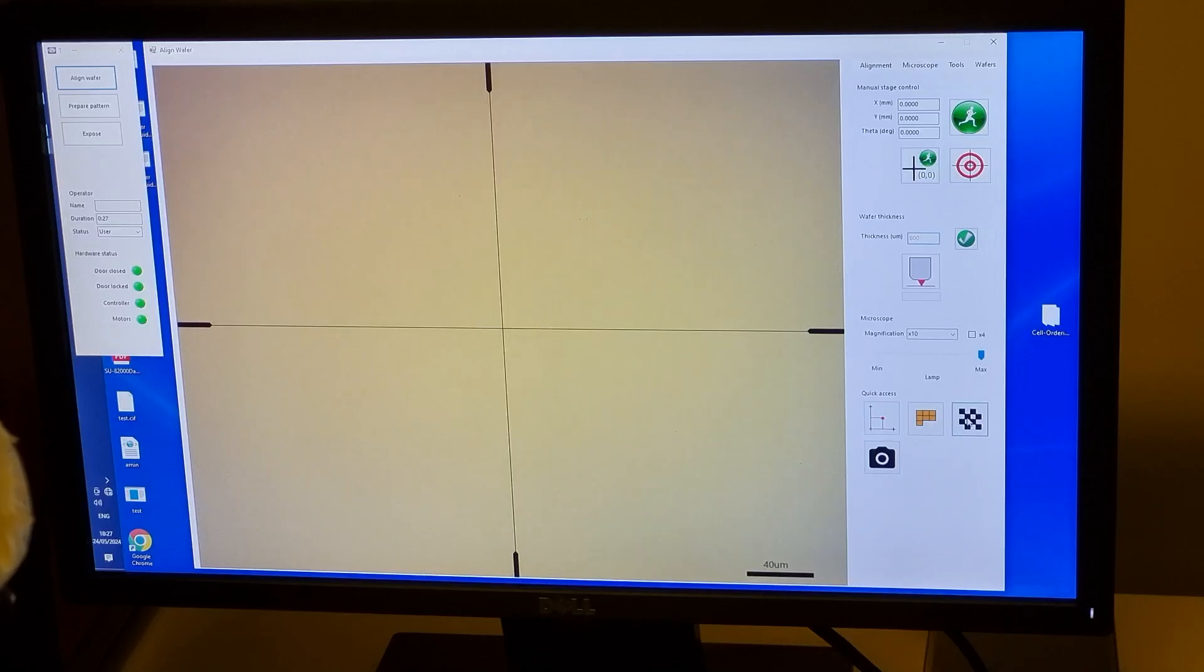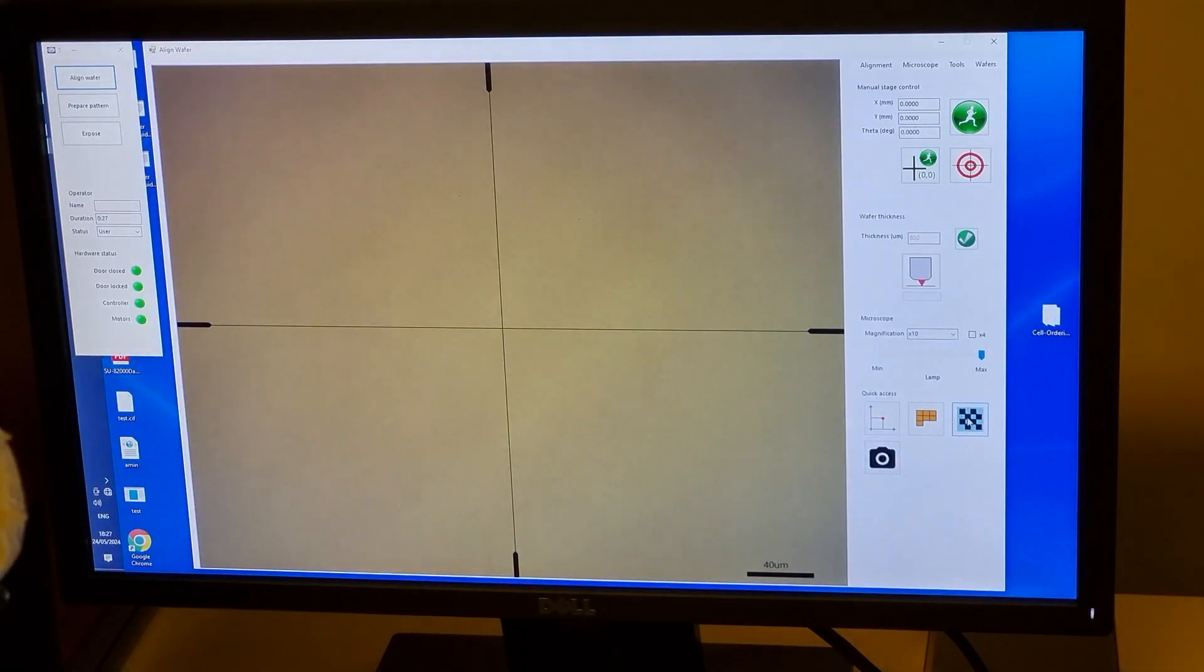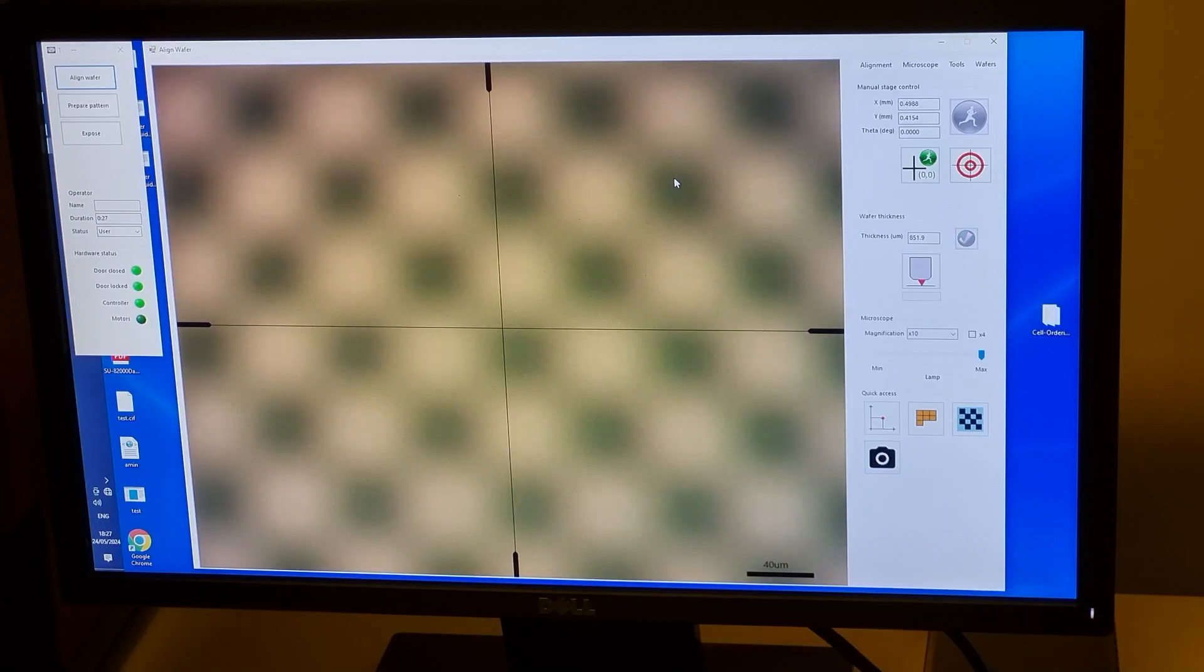We now need to help the machine focus on the surface. Enter the approximate wafer thickness in the text box, then turn on the optical checkerboard. Now use the mouse scroll wheel to move the substrate up and down and bring the checkerboard into focus. The checkerboard pattern is projected onto the substrate by the same microscope and digital mirror device that will create the exposure pattern.